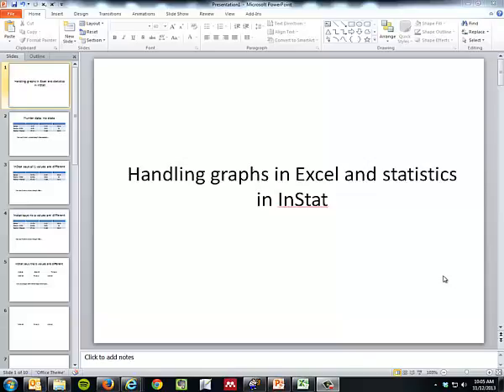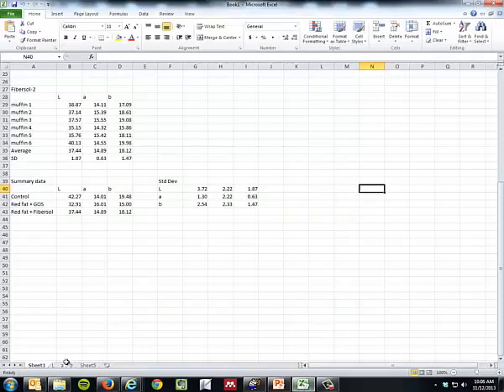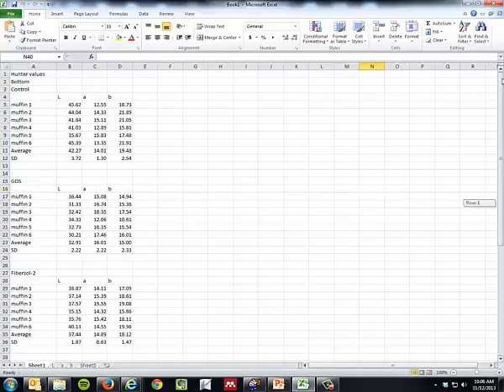This is a presentation on handling graphs in Excel and statistics with InStat, which you may find useful when you are doing your final research project report. What I have here is some Hunter data. This was from muffins.